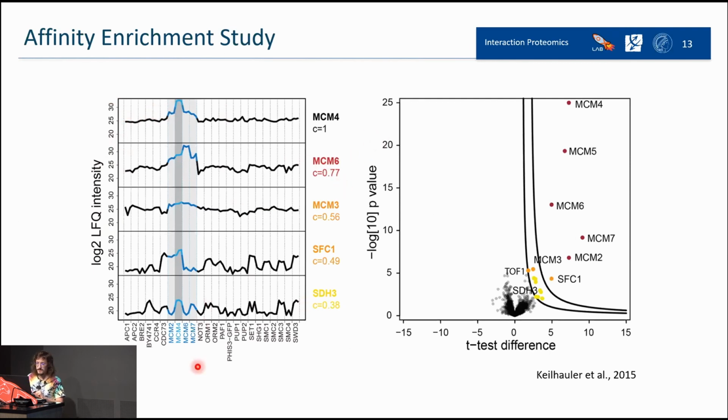They thought, well, if we see something that has a similar profile, it means that it probably is a specific binder. Because otherwise, if it binds unspecifically, we will see, for example, that protein enriched in one experiment, but definitely not in the other, because in the other something else attached there.